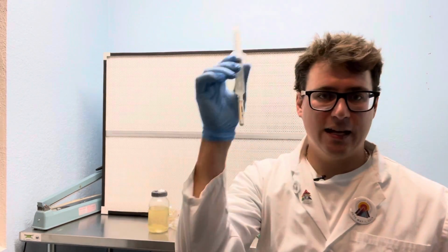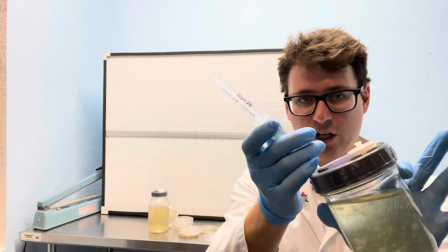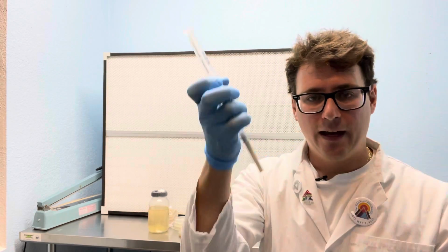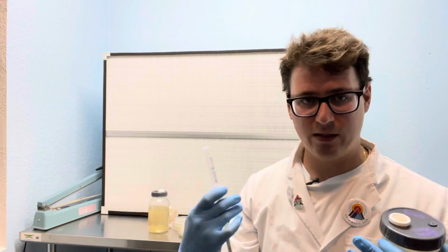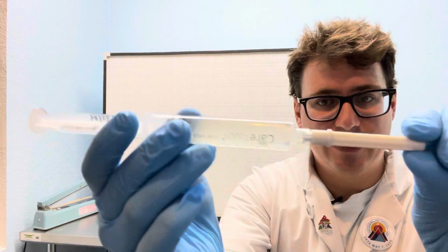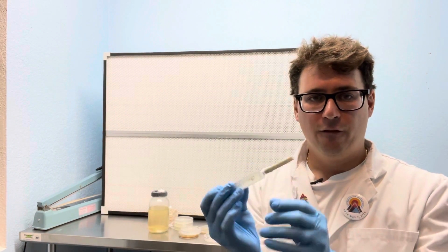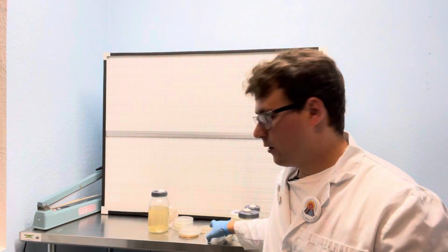So basically you would take your sterile needle and your sterile syringe, inject it into the lid, pull it up, and then release, and you have successfully transferred that culture without introducing any oxygen or any potential contaminants. And then when you go to make your injection, the size of these needles is so small that the opening for any contaminants to get in here is significantly less than the opening for the petri dish. So that's another benefit for liquid cultures.